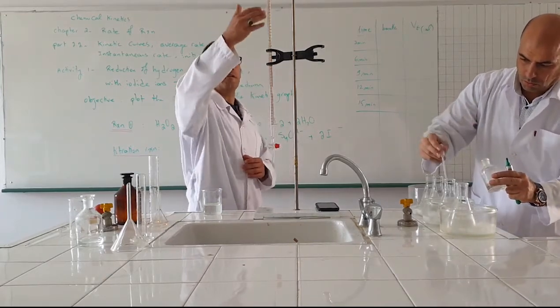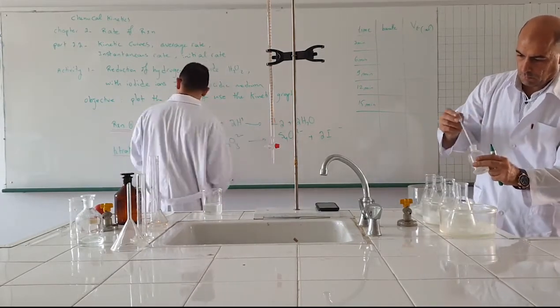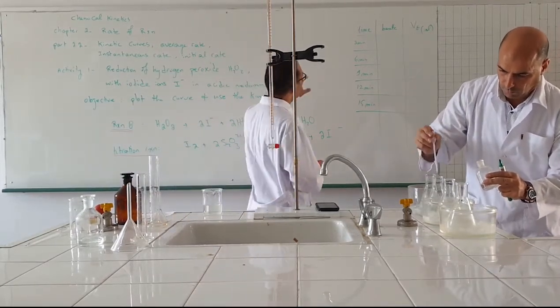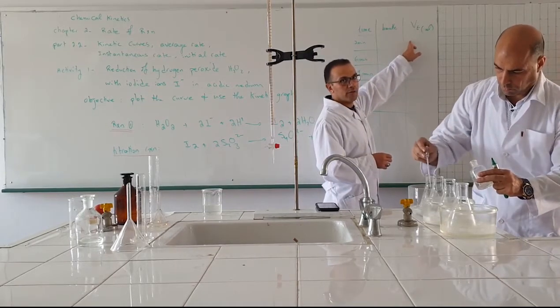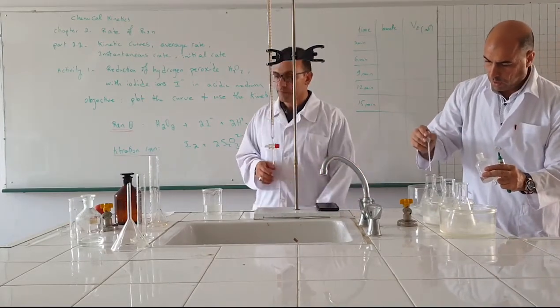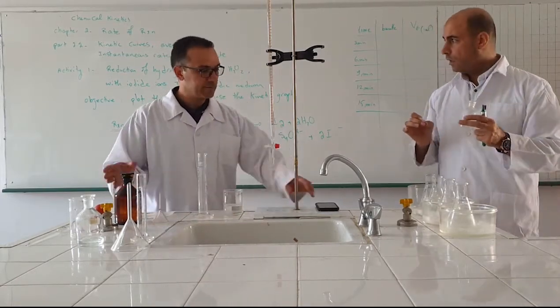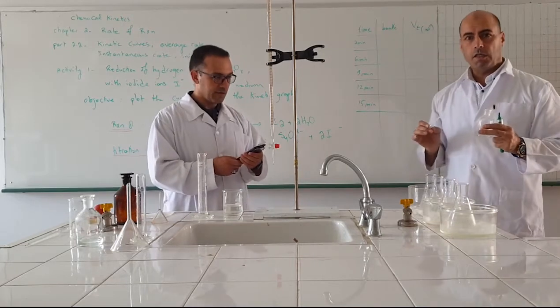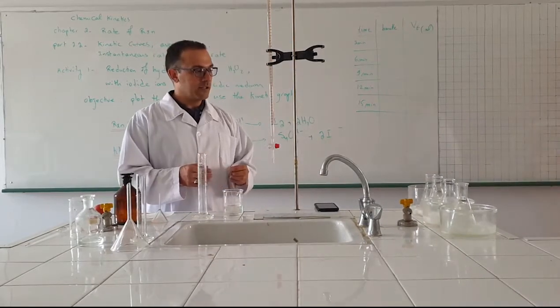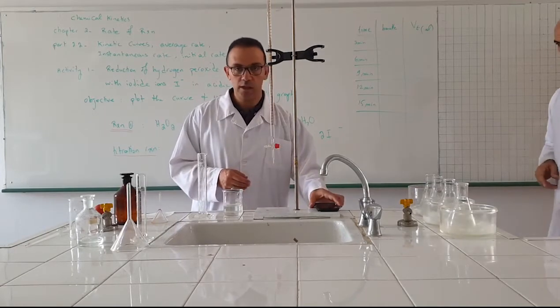The burette is filled with sodium thiosulfate so that iodine produced by reaction number 1 is titrated by the thiosulfate solution, and finally we are going to record the volume needed to reach equivalence corresponding to each titration at these several instants. The aim of using starch solution is to obtain a dark blue color in presence of iodine, even in small concentration. So when equivalence is reached, it is detected by the disappearance or the decolorization of this blue color.